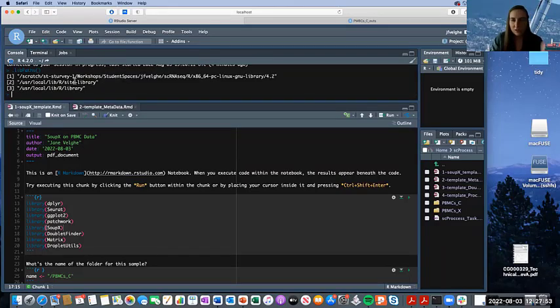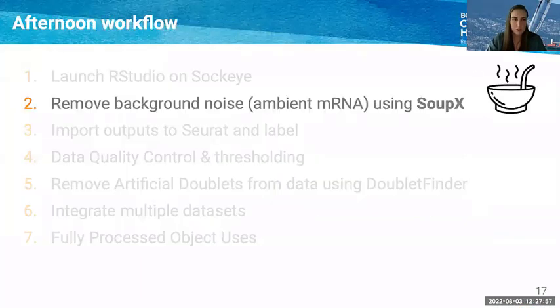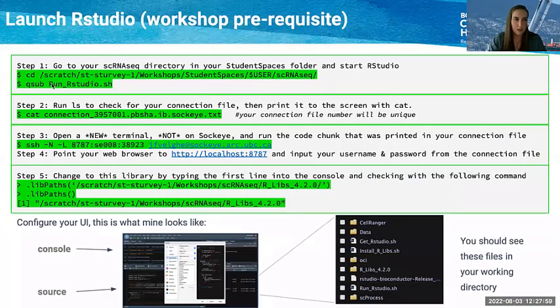Okay, so I actually also have to set mine up really quick. So I'm just going to pop over here. And then I have to type this all out as well, if it lets me. Okay, I'm just going to pause my share, leave this up, and do this quickly.